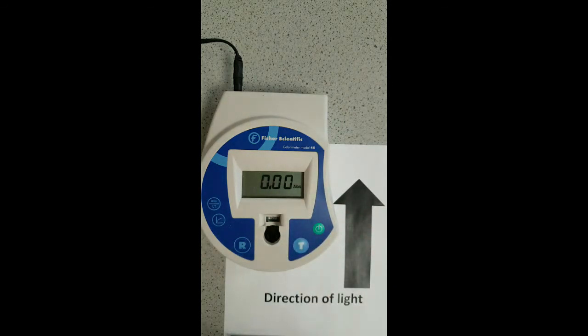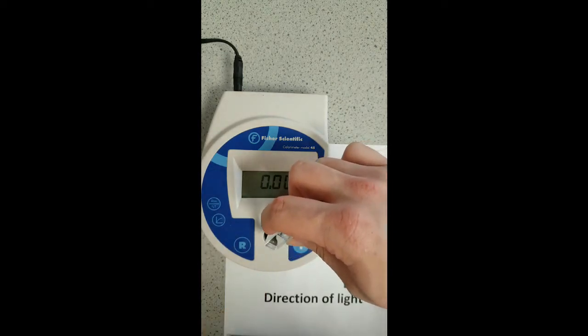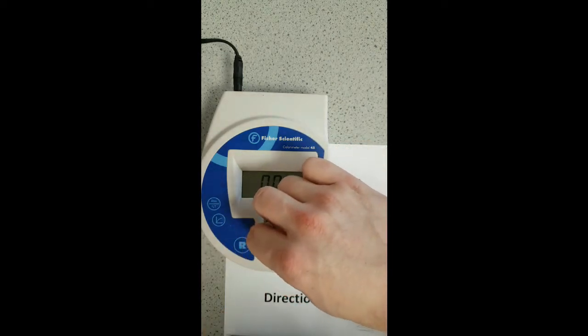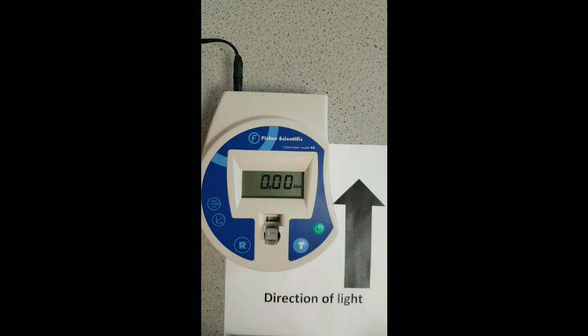Now let's run a reference sample. Remember to make sure that you orientate your cuvette so that the clear windows are facing front to back. Then press R for reference. That gives us an absorbance value of 0, which makes sense because our sample is clear and light is passing straight through. There's no absorbance.